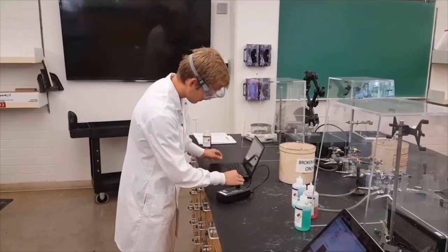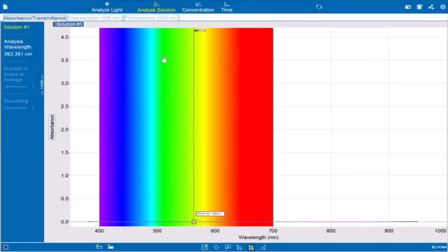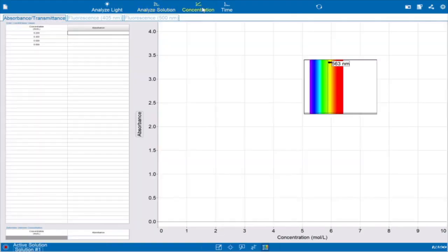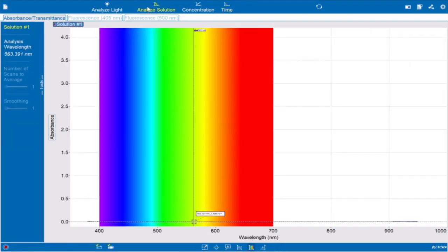Connect a spectrometer to your device using a USB cable or a Bluetooth connection, and then open the Spectrometry program. PASCO Spectrometry is a software we'll be using frequently for this class. Let me give you a brief tutorial on some of the features you may find useful. Notice the four different settings on the bar above the graph. The Analyze Solution setting helps us see the absorbance or transmittance spectrum of many wavelengths for a given solution. On the top left corner, notice that there is a paper document icon — use this button to save your data frequently, just in case your computer unexpectedly closes the program.